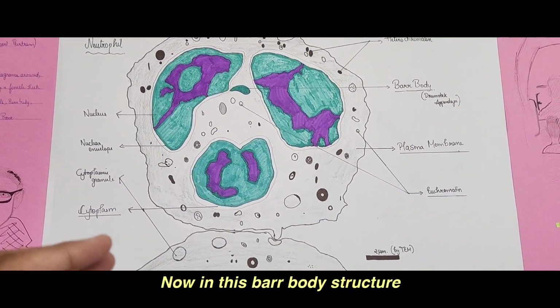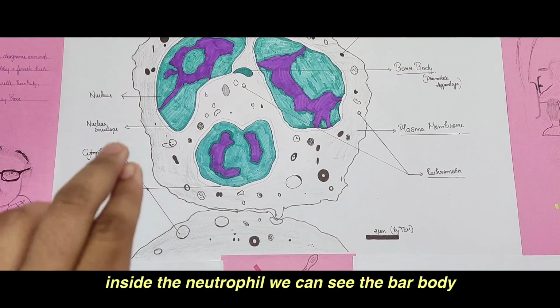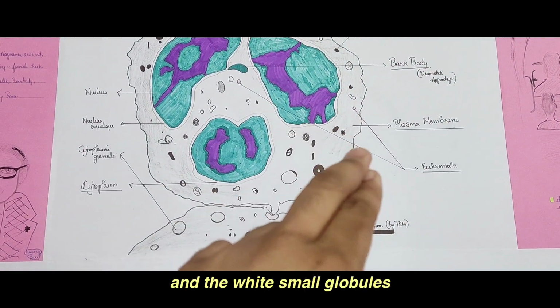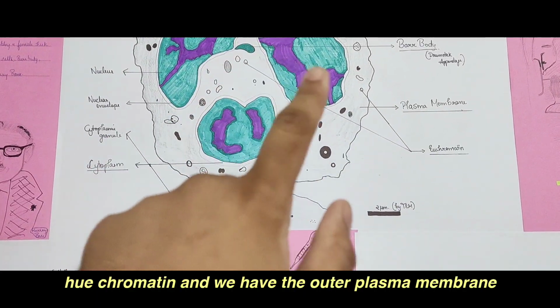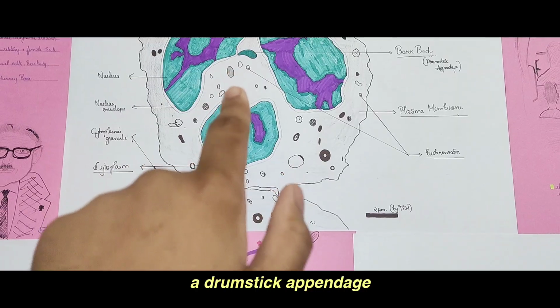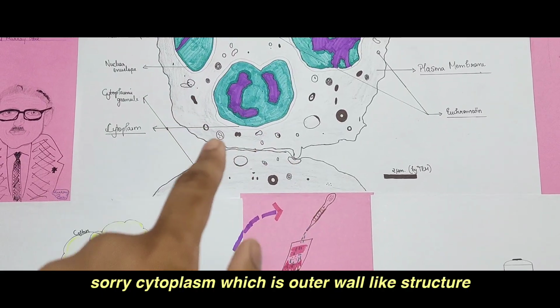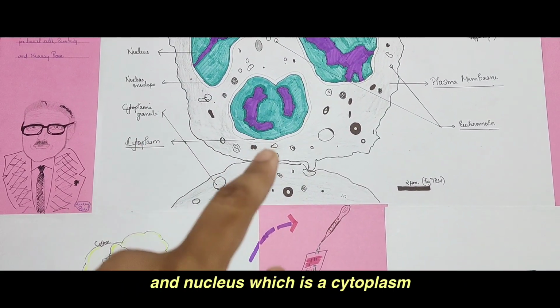Now we'll move on to the structure of the Barr body. In this structure, which is a part of a neutrophil, inside the neutrophil we can see the Barr body. We have the black-stained heterochromatin and the small white globules of euchromatin, and the outer plasma membrane. Here is a Barr body, a drumstick appendage, and we have the cytoplasm, which is the outer wall-like structure on the outer side of the cell, and the nucleus.